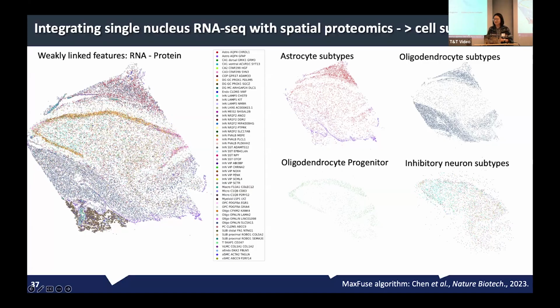Hi, yeah, if you can hear me okay. Yep, we can. Awesome. Yeah, it was so cool to see all of this. So I remember you mentioning that a lot of interesting stuff is happening away from the nucleus in these far off projections. And because of the limitation of bounding these cell bodies, it looks like a lot of the neighborhood analysis is happening still around those cell bodies. Is there any way using this technology you can see going forward to look if there's spatial patterning around specific proteins that are associated more with the projections, like certain behavior that seems to crop up at the axon or dendrite level?